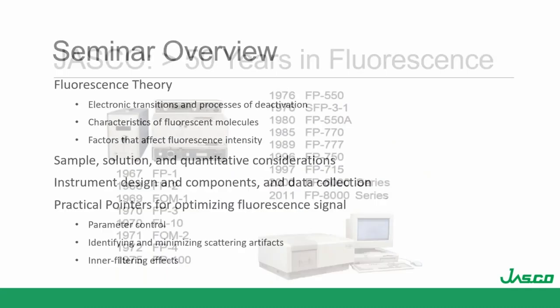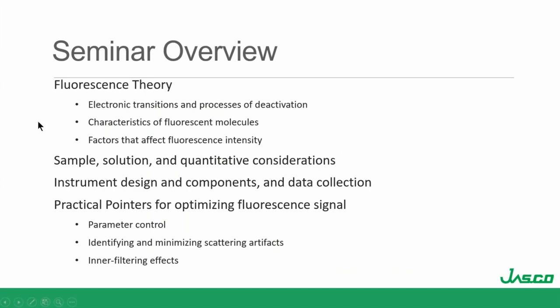So I'm excited to share with you fluorescence theory, sample solution, and quantitative considerations, instrument design and components and data collection, as well as close out with some practical pointers for optimizing fluorescence signal.